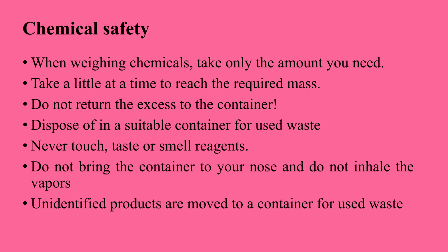It's better to take an additional portion, because if you take some chemicals, it's forbidden to return the excess mass to the container. If it happens, you should move these excess chemicals to used waste. Often these chemicals are very valuable.